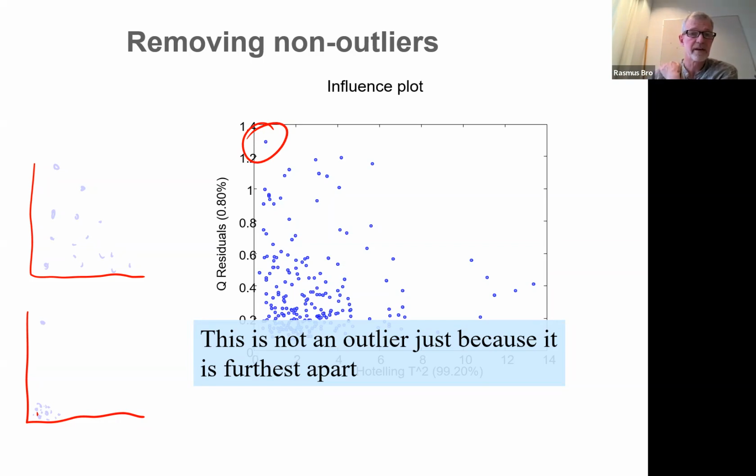So it's very fine to identify outliers. We have a number of tools for doing that. But once you have identified the outliers, don't remove them, explain them. And this is such an important trick. Once you explain the outlier, then you will know what to do.